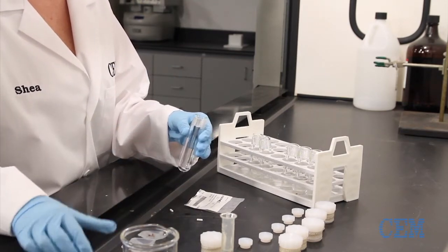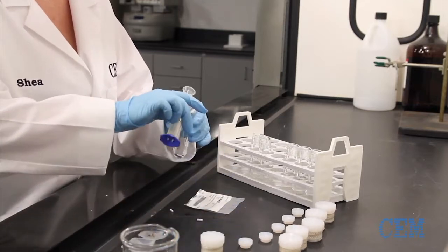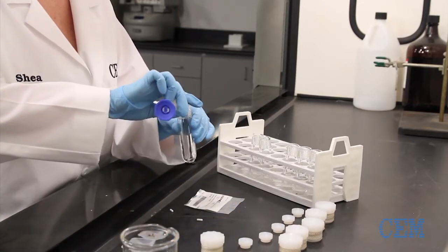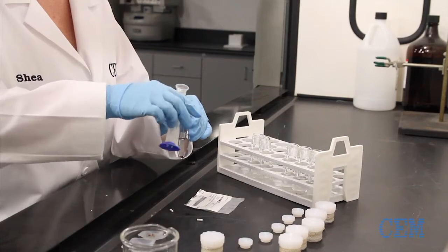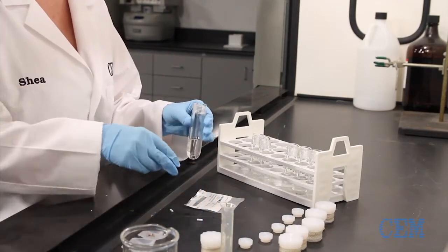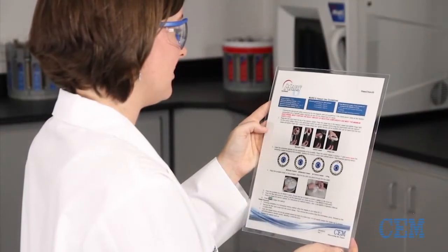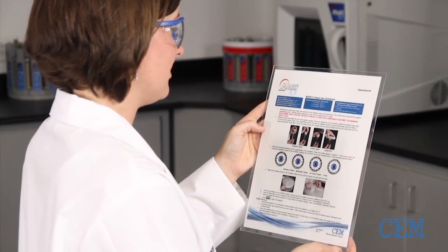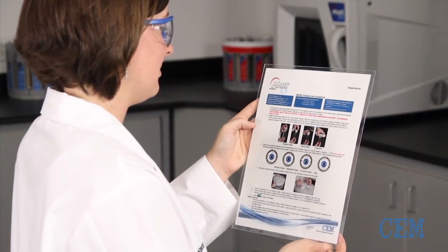The same reaction solution and volume must be used in all vessels in order to meet the minimum volume requirements of the MARS-6. These requirements can be found in the MARS synthesis quick reference guide included with your instrument, in hard copy form as well as on the touch screen.